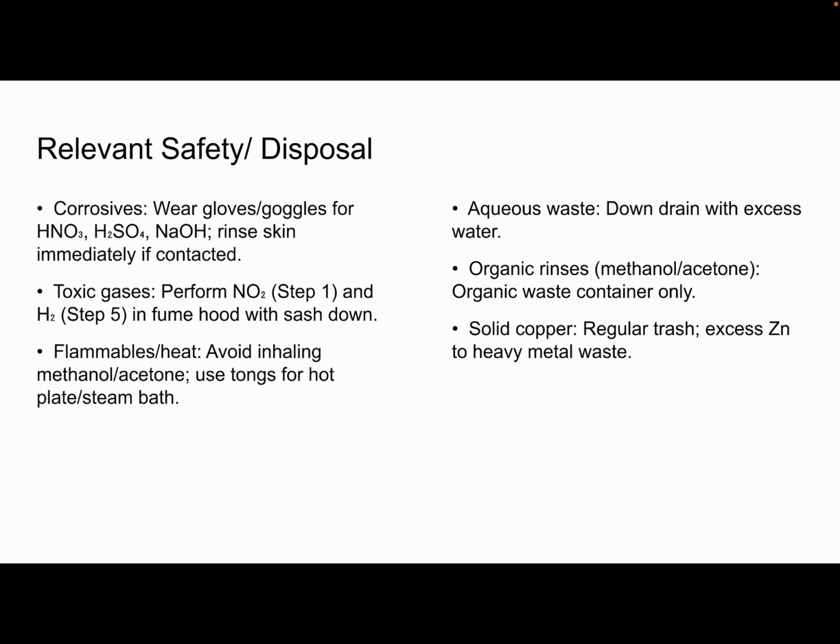These are the safety and disposal rules. There was corrosive stuff like the acids, the sulfuric acid, the sodium hydroxide, and other stuff. We wear gloves and goggles for it. There were toxic gases, which is why some of the stuff was done under the fume hood.